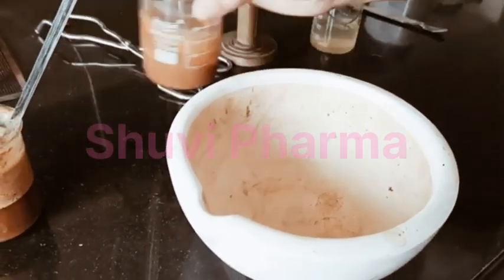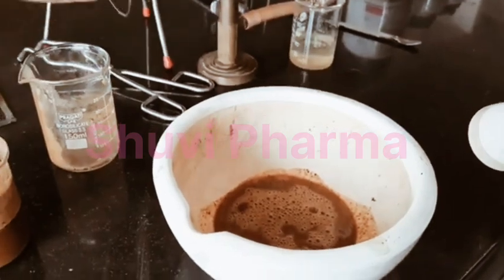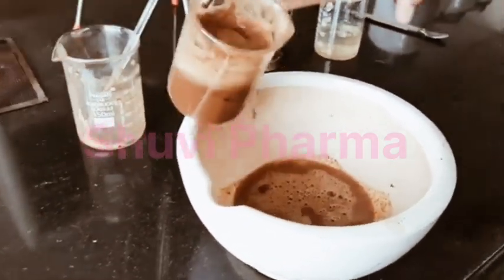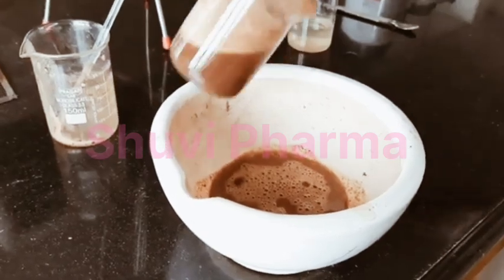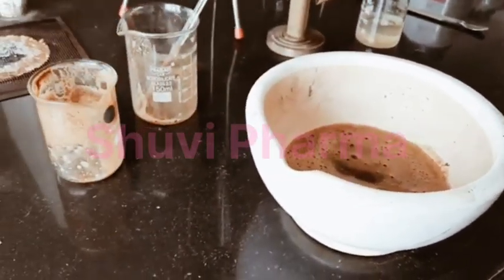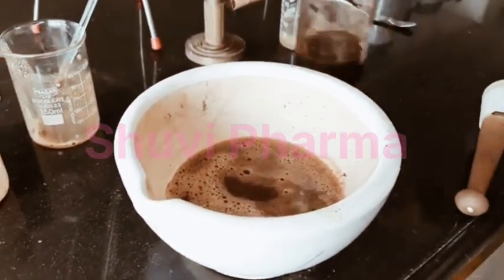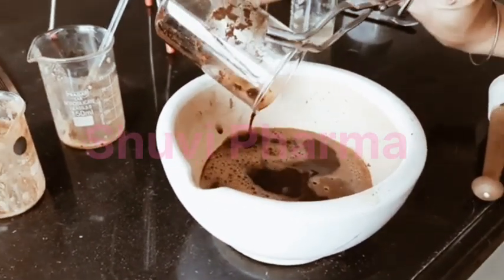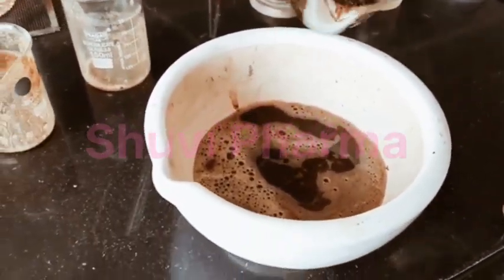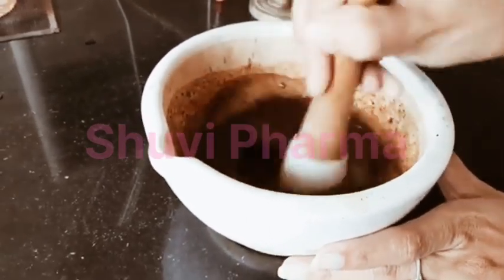Now we will add this extract in mortar and pestle and we will triturate them properly. Now we will triturate this extract.